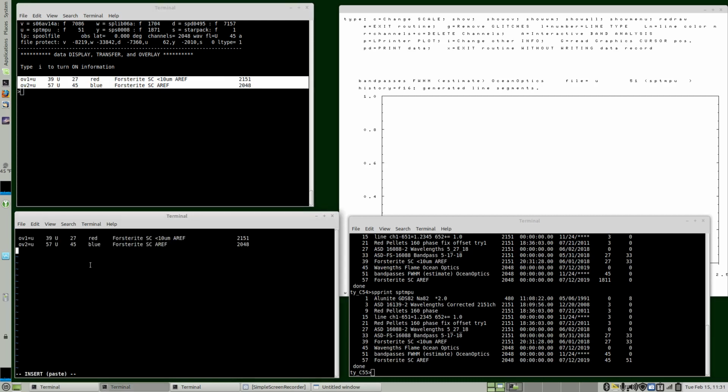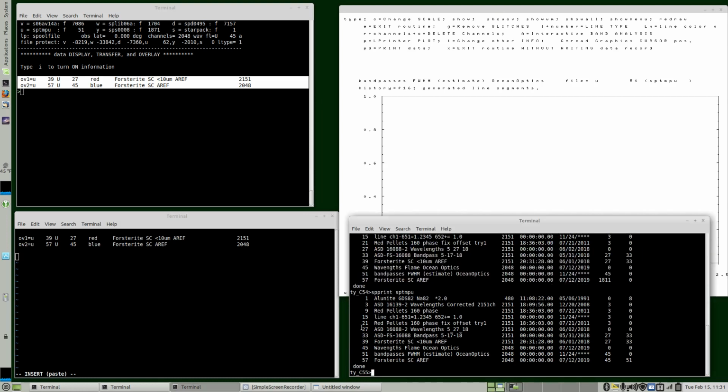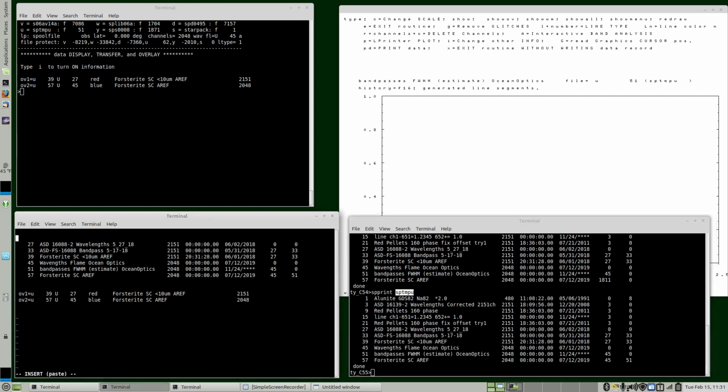So if we wanted to overlay these again, we could. And these are not saved in the restart file, so you'll have to load them every time you start Specpr. And then the other things that we need are, we need this group here. So let's put that up here. And to be sure what file this is coming from, I normally put that in there too. So now we have a good record of what we're doing.